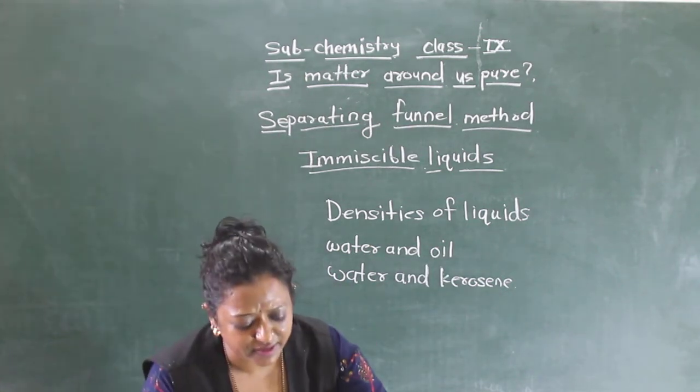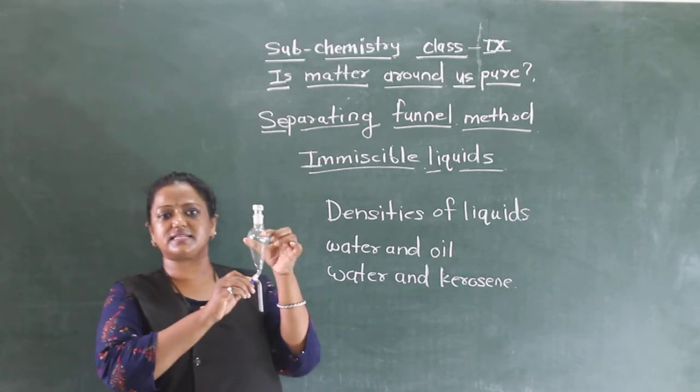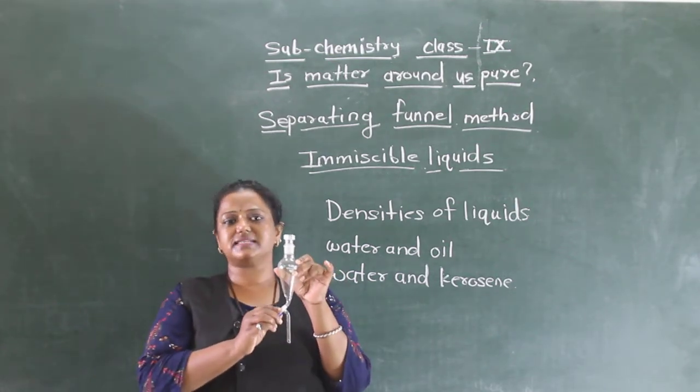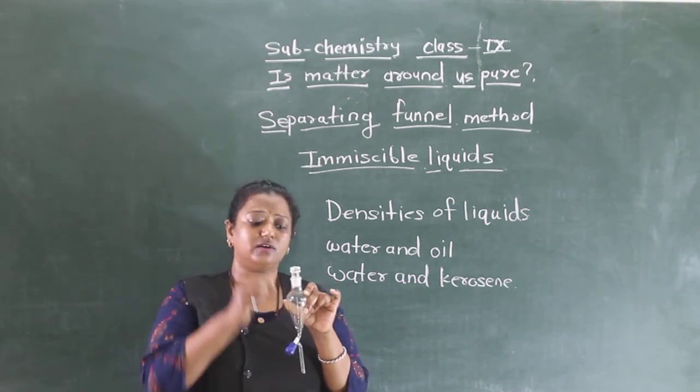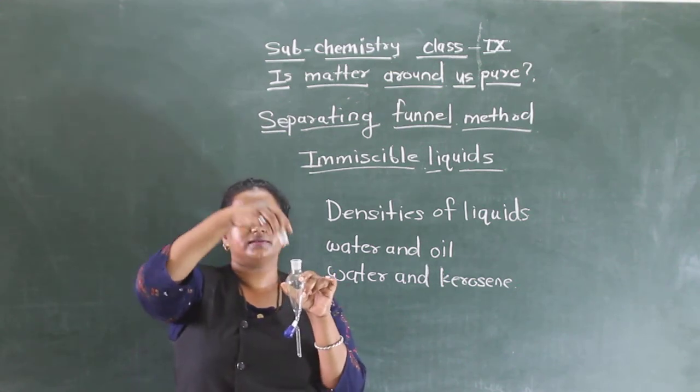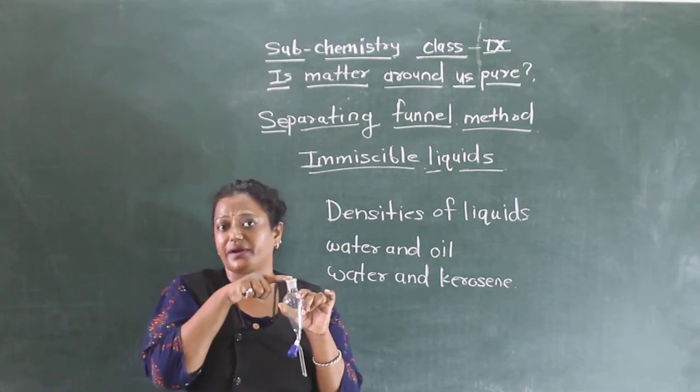So here is my equipment. I would like to show you how this method exactly takes place. You can see, this is my apparatus. This apparatus is called a separating funnel. What we do is, we pour the liquid which is to be separated into this cup.